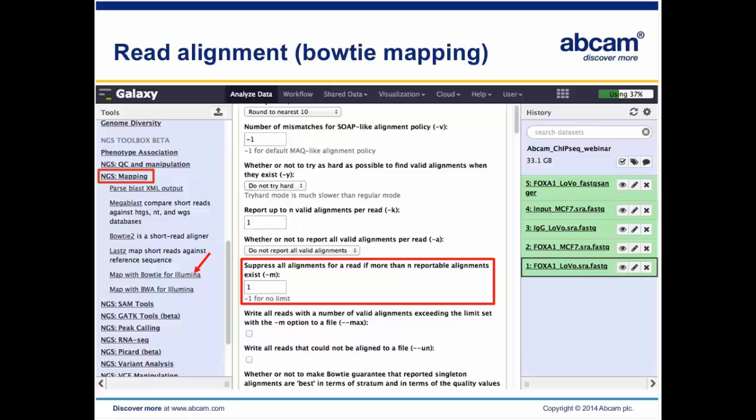To put it simply, some reads can be mapped to multiple locations within the genome. And you can handle these reads differently according to your need. But now, we put 1 here, which simply discards those reads. This is a good starting point for beginners. And actually, many people are still doing this when they analyze DNA-centric sequencing data, like ChIP-seq, DNA-seq, and ATAC-seq.